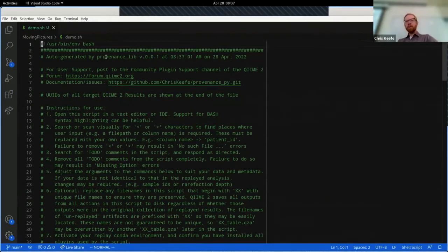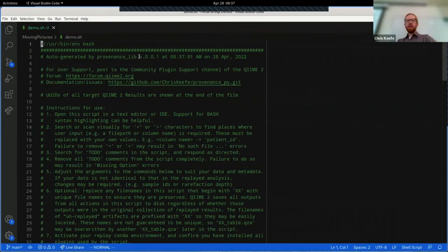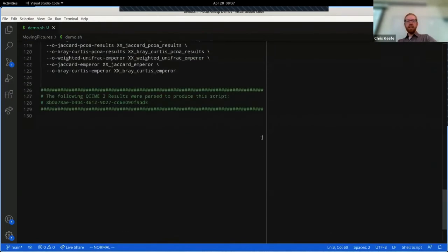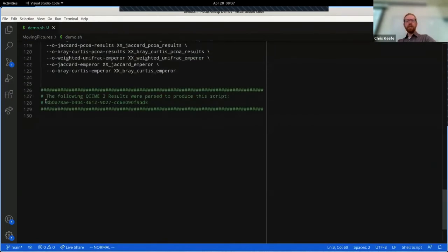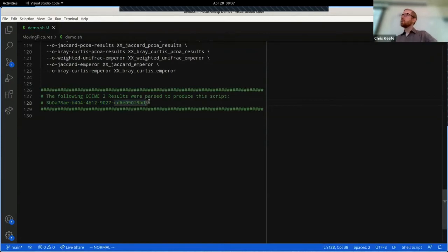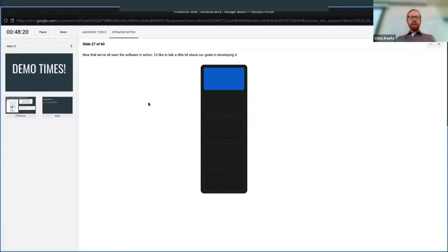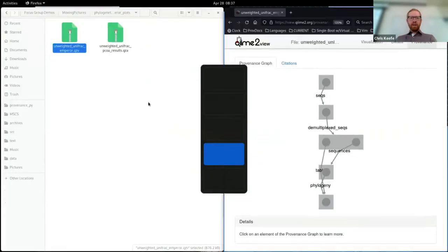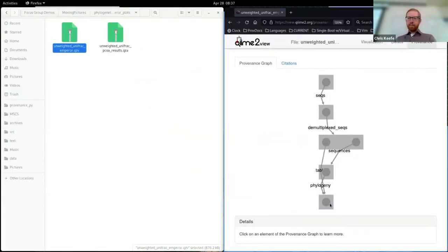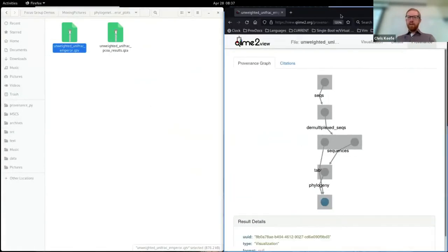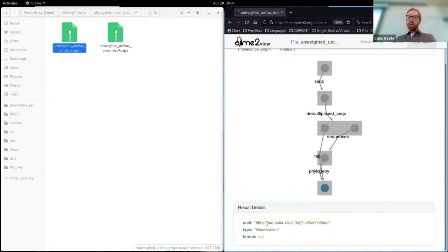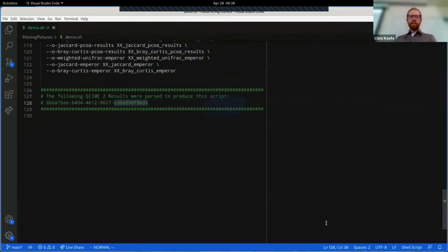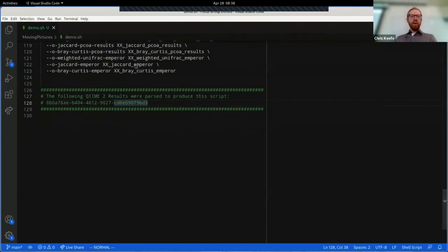It tells us what software was used to make this, what version and what time it was produced. It tells us down at the bottom the unique identifiers of all of the QIIME 2 results that are represented by this script. So we can clearly identify that this guy right here, which is UUID 8B0A, etc., etc.